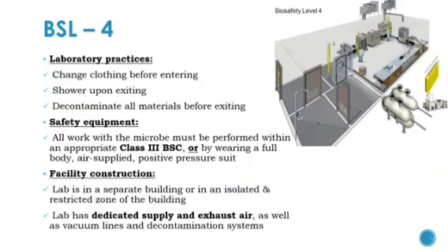Biosafety level 4. The microbes in a biosafety level 4 laboratory are dangerous and exotic, posing a high risk of aerosol transmitted infections. Infections caused by these microbes are frequently fatal and without treatment or vaccines. Two examples of microbes worked within a biosafety level 4 laboratory include Ebola and Marburg viruses.